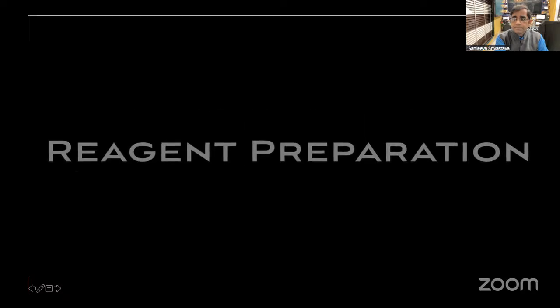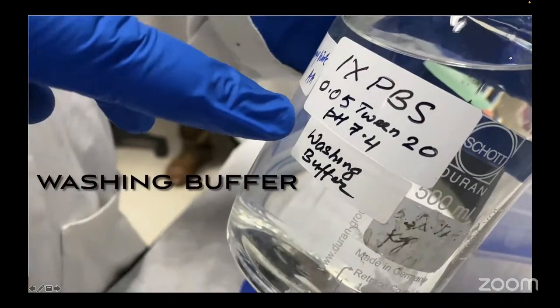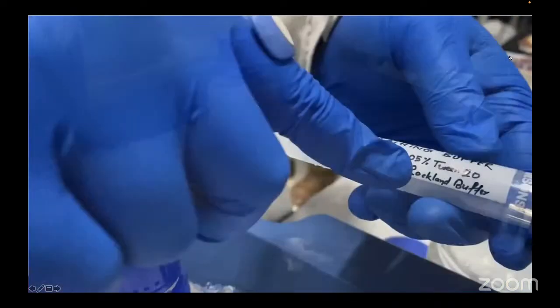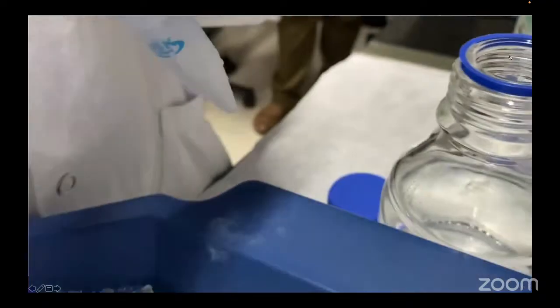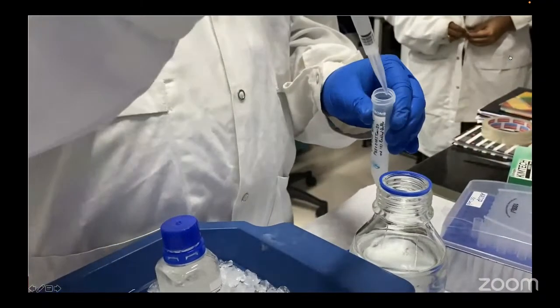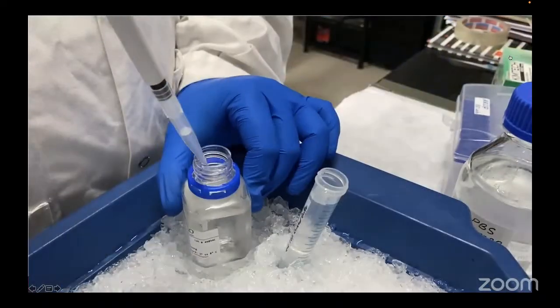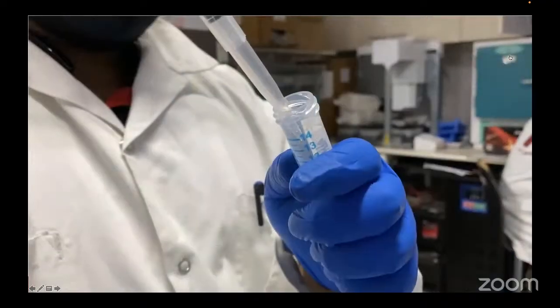Today, we will be demonstrating peptide microarray technology. The first step involves reagent preparation, namely washing buffer, staining buffer, and Rockland blocking buffer. After preparing the reagents, we move on to incubation tray assembly.